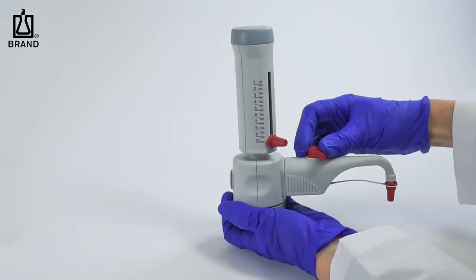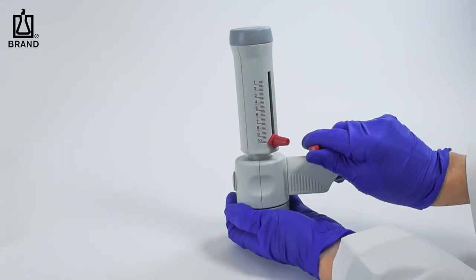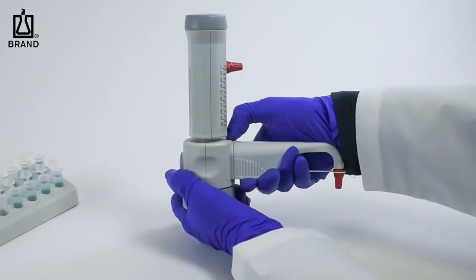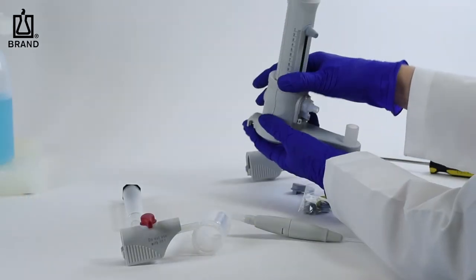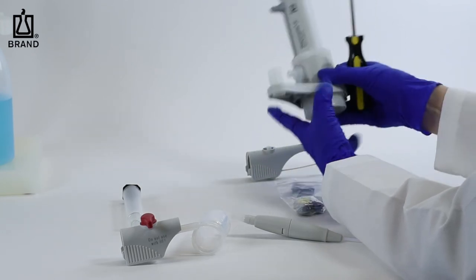If the dispenser has a recirculation valve, turn it to the recirculation position, then remove the colored valve cap. If the dispenser does not have a recirculation valve, simply lift the discharge tube up and pull from the housing. Mount the flexible discharge tube holder to the bottom of the housing and tighten until secure.